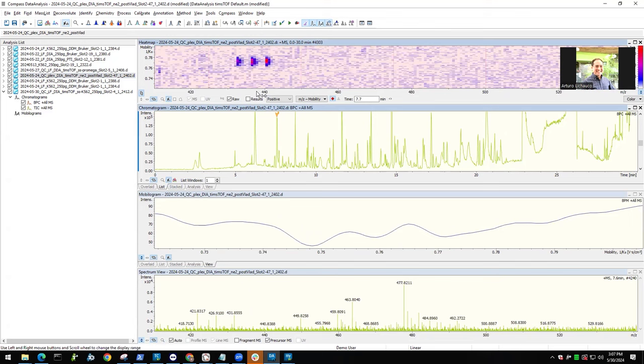So when you do a plexDIA experiment, let's say you have three different cells. You have your mTRAQ label attached to them: the zero, the four, and the eight. And that's how it would look in ion mobility. You would separate them by mass, but they would appear at the same ion mobility because the tag is the same and the shape of the peptide is the same. So you basically identify directly by looking at it, oh yeah, that's a three-plex labeled peptide, right?